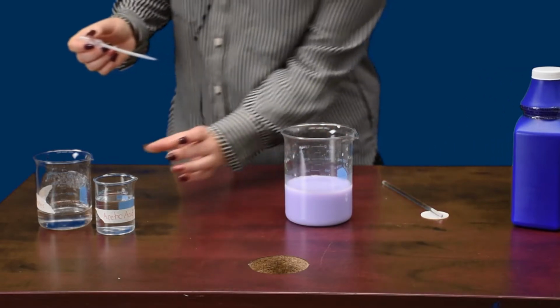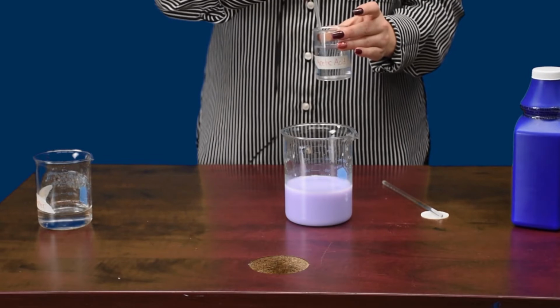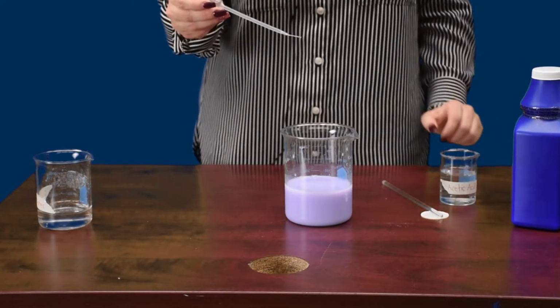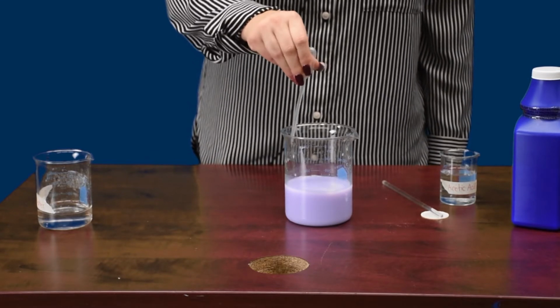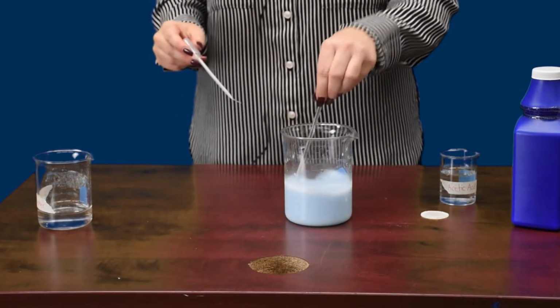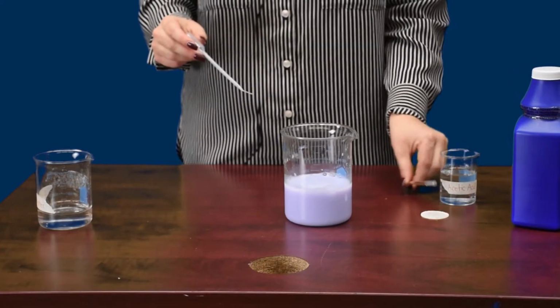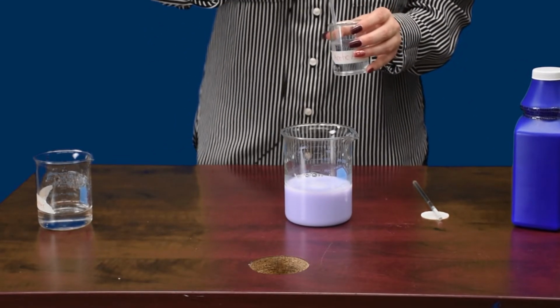Next thing we're going to do is you are going to take your acetic acid or vinegar. I'm going to add a few squirts of this to my solution here. While I'm doing this, I want you to start thinking about some questions that you might have about this experiment. Okay, so as you might have seen there was a slight color change. I'm going to add another few squirts here now, in case you missed it the first time.